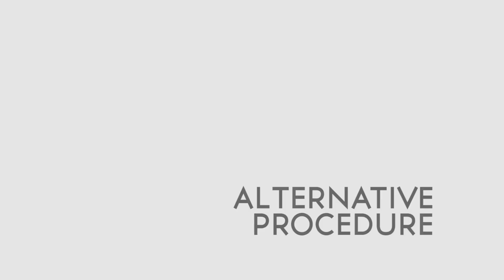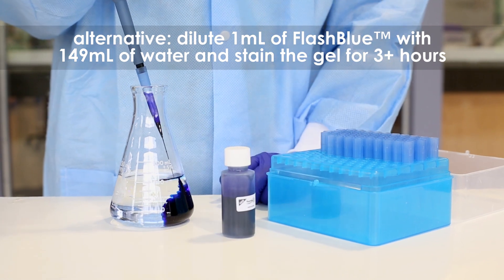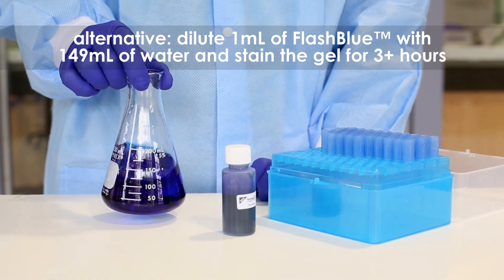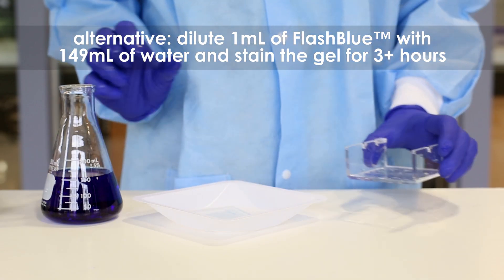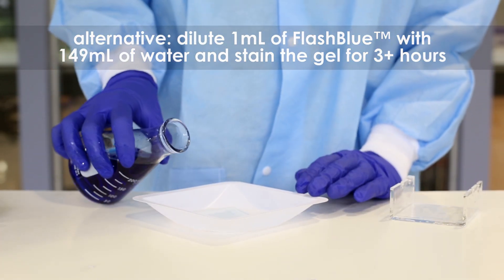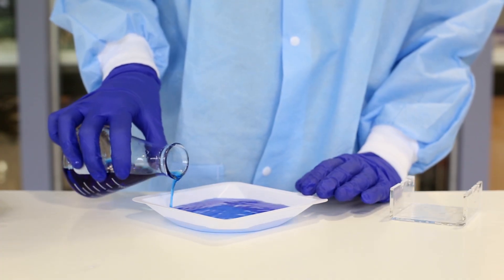Alternatively for this experiment, you may dilute 1 ml of the concentrated Flash Blue Stain with 149 ml of distilled or deionized water. Submerge the gel in this solution for at least 3 hours or overnight. The gel will both stain and destain in one easy step.